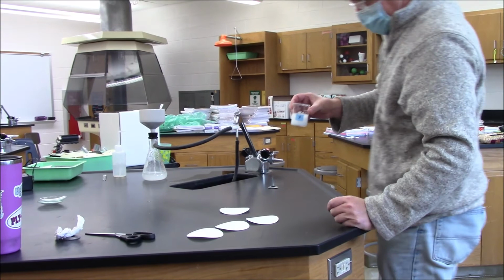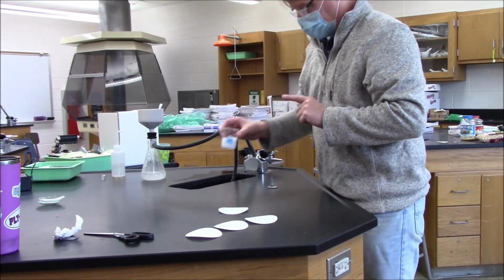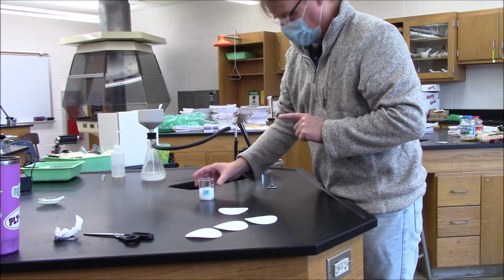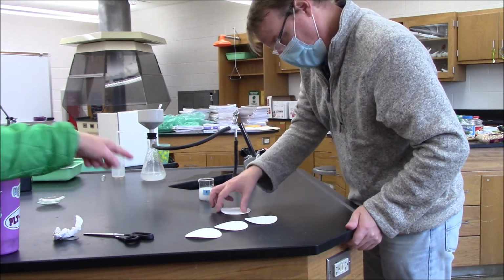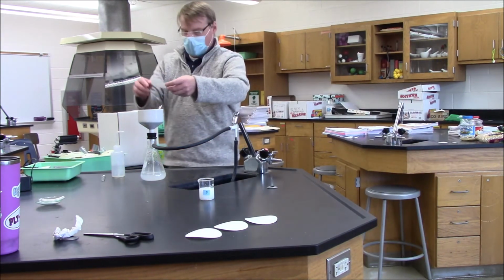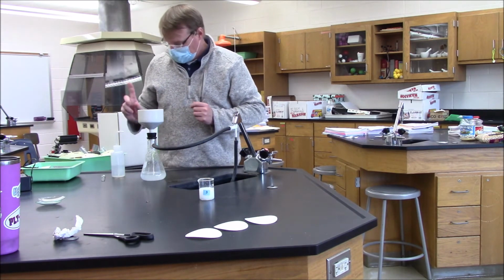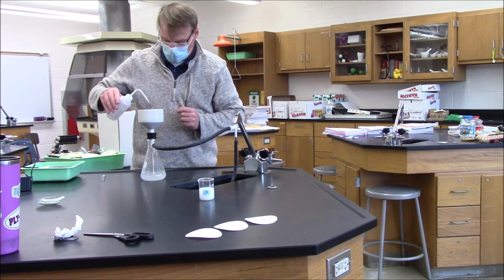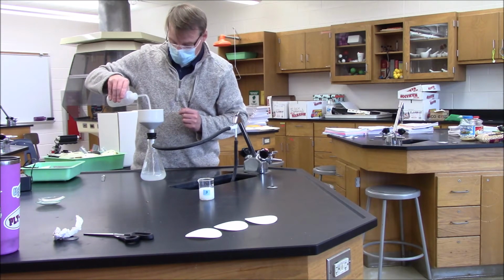Okay. All right. So now you can place it on the countertop, that's fine. You're going to take the filter paper that says number 3 on it. This one? Yep. And you'll put it in the funnel. Just drop it in, kind of like a coffee filter. Now you can go ahead and wet it. It doesn't matter how much you put in there, but it definitely needs to be wet.